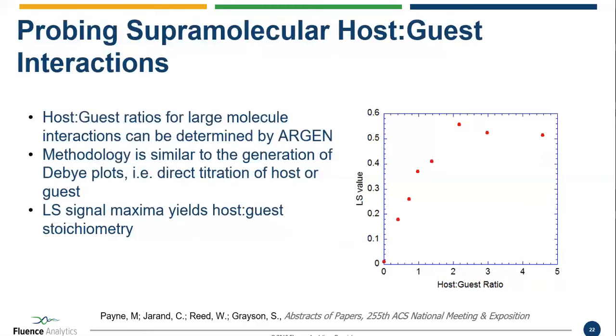We've also had some thoughts of doing this, looking at, for example, antigen-antibody interactions as well, using a similar methodology.